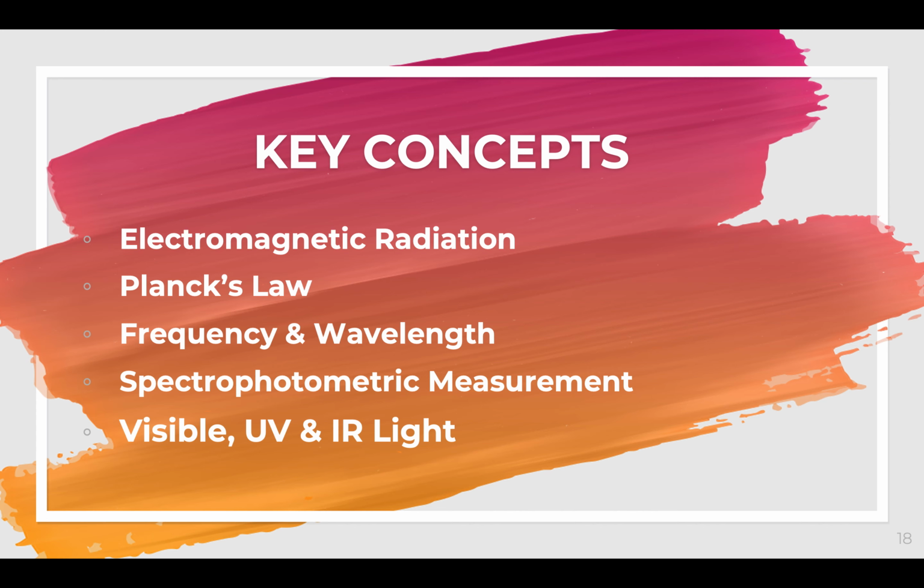Later on, I will be giving you the different components of your spectrophotometer, and this is now where we will be diving into your machine, your instrument, the spectrophotometer.